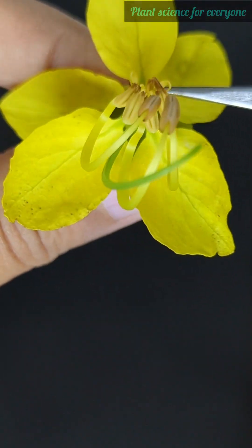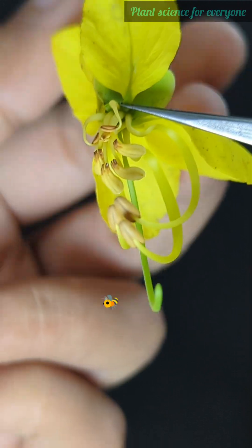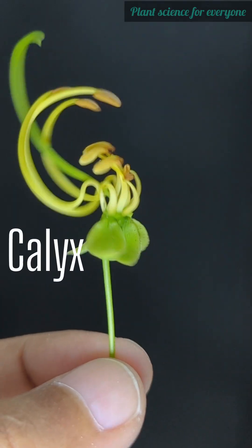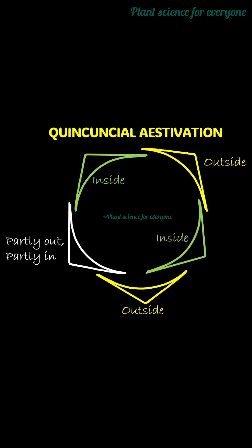Cassia fistula has bright yellow flowers which make it highly visually attractive to pollinators, especially bees. The corolla has five petals that are all free from each other — that is polypetalous. The calyx is green and has five sepals arranged in a quincuncial overlapping pattern. Quincuncial aestivation has two external sepals, two internal, and one partly in and partly out.